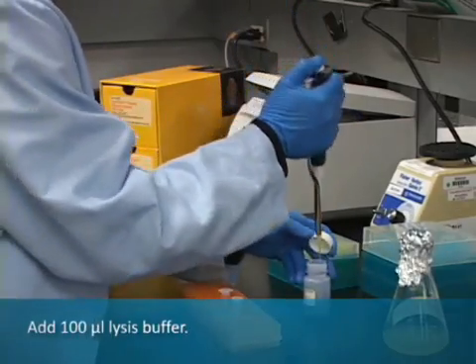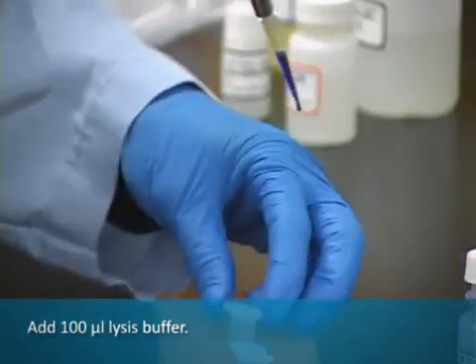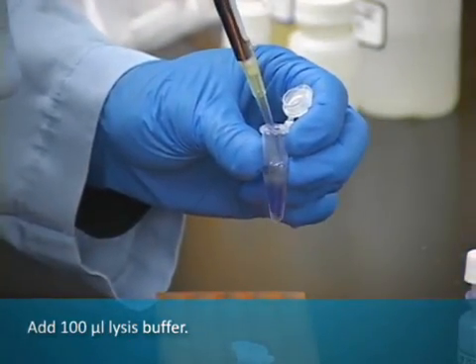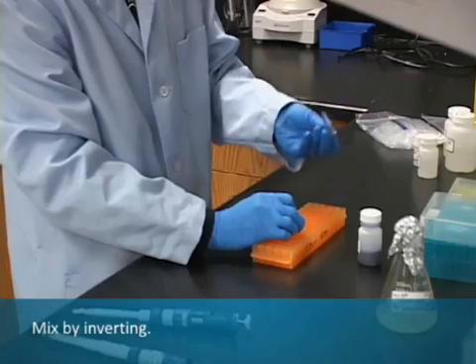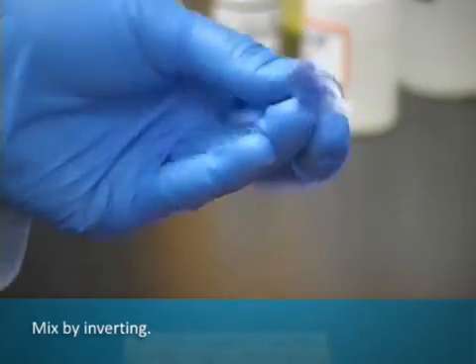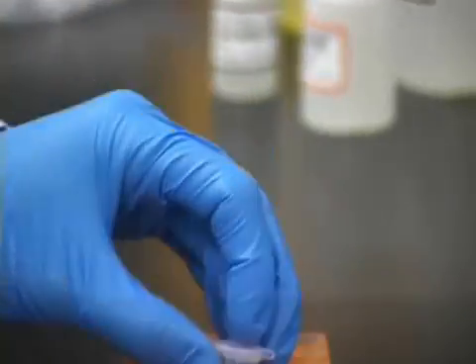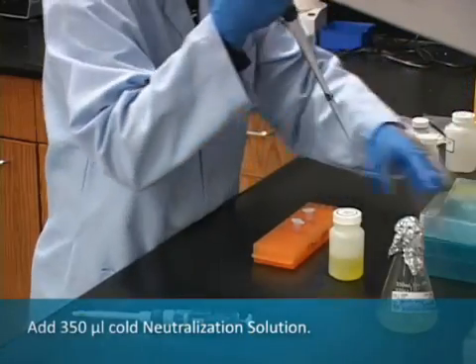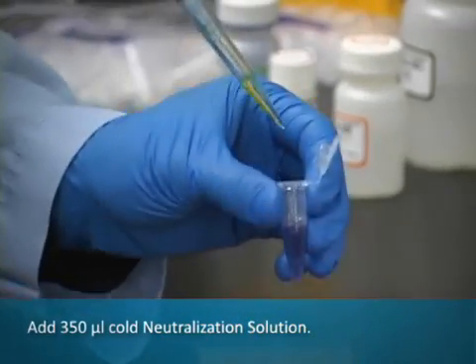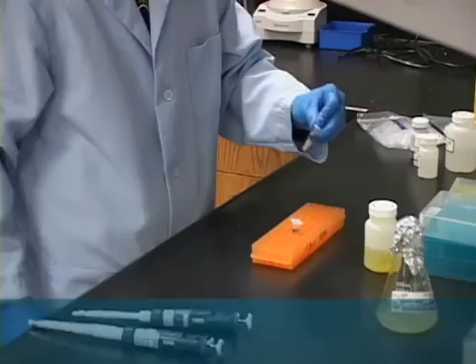To the 600 microliters of culture, add 100 microliters of blue cell lysis buffer and mix by inverting. Add 350 microliters of cold neutralization solution and mix by inverting until the color changes completely from blue to yellow.